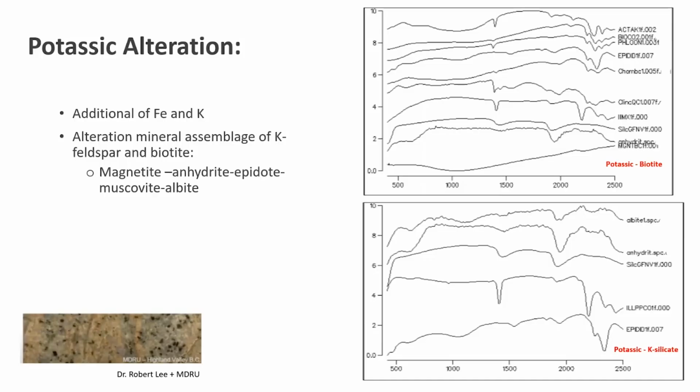So a lot of these applications, our spectrometers will be used in concert with a lot of different other methods for geological applications, and many of the people in this webinar probably know that well, but these are meant to be part of a suite of lab instruments. Many of the mineral identifications can be done with our instruments, but some don't have the spectral features in our range, and so some mineral samples may need other methods.